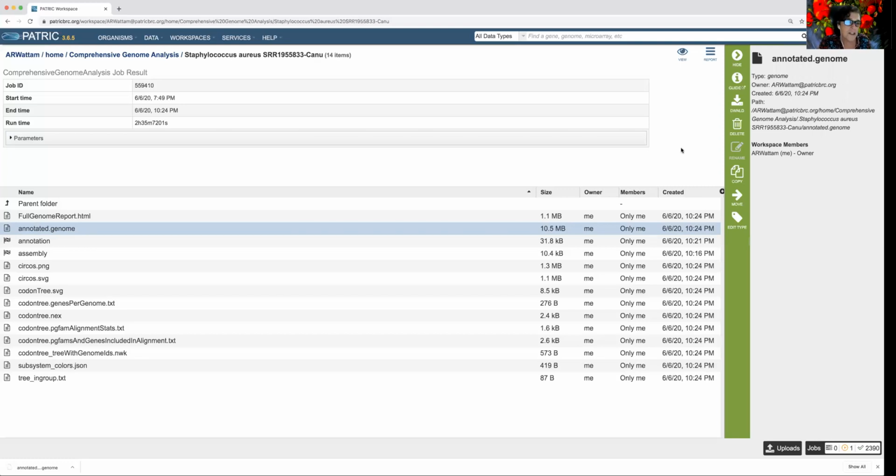And so what it's showing you is data that this file is really for a computer to read. I'm a biologist, I don't read those things, but the computer scientists I work with, they do read it. So I guess the importance of it depends upon where you're coming from. And we provide it there for you if you want to see it.